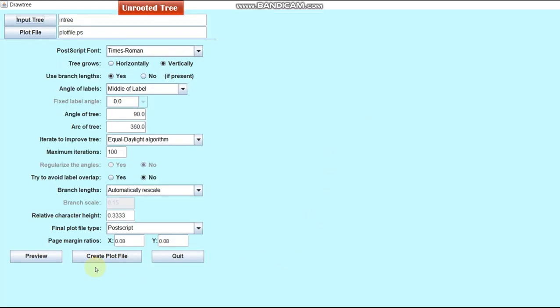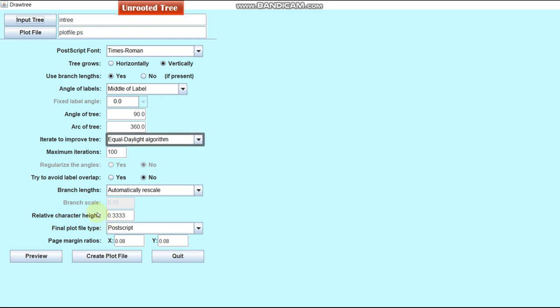DrawTree has some different parameters from Drawgram that includes angle of tree, arc of tree, iteration to improve tree, maximum number of iterations and relative character height. Here, the default algorithm to improve tree by iteration step is Equal Daylight Algorithm.